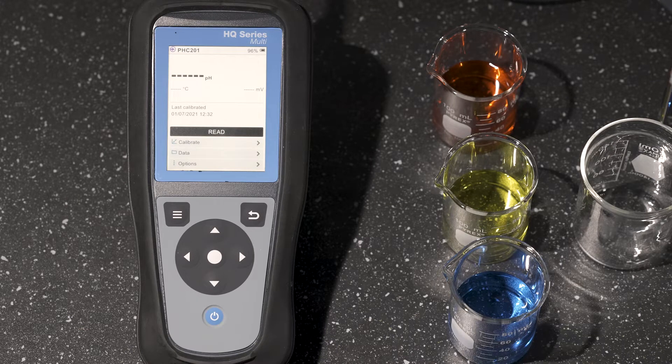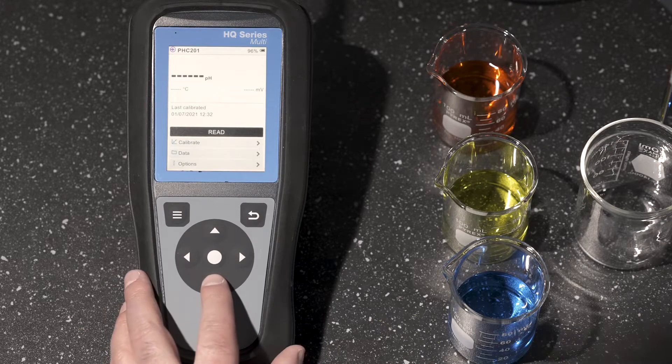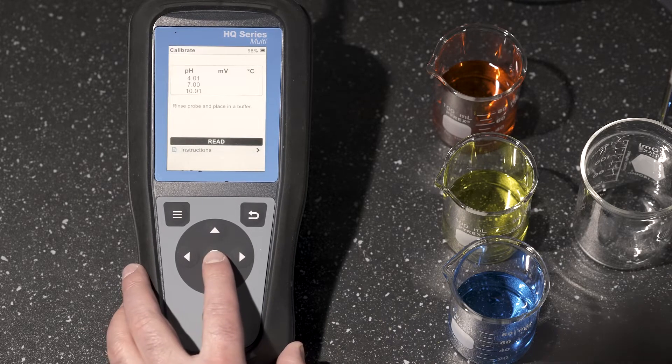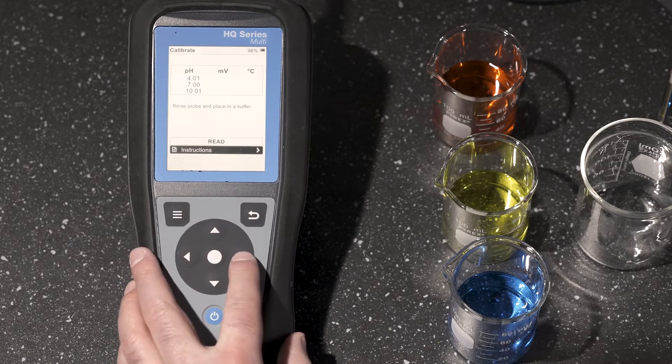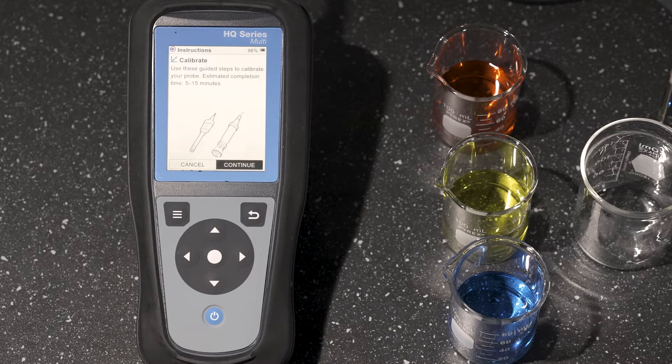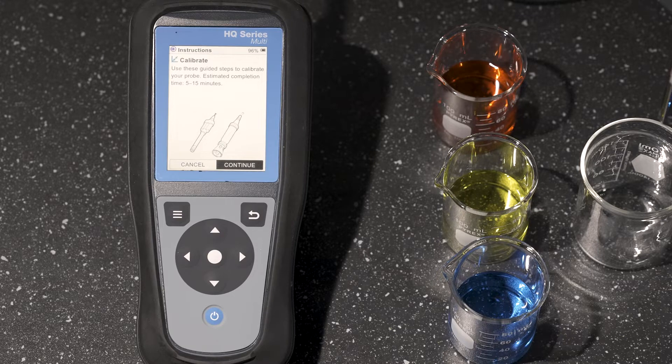Here we are at the home screen of the HQ Series 4300. I'm going to go ahead and highlight calibrate. Here we are at the calibrate screen. I'm going to highlight the instructions and this is going to walk us through those guided steps.